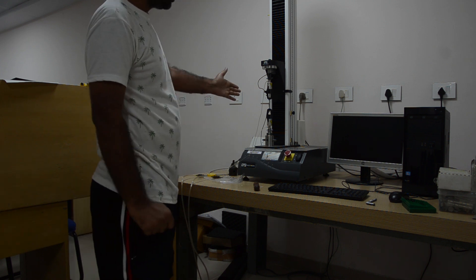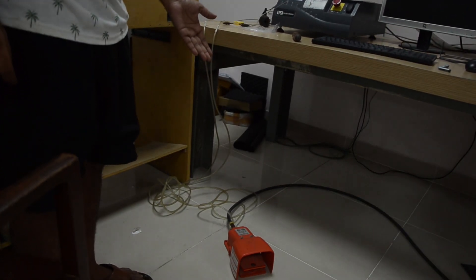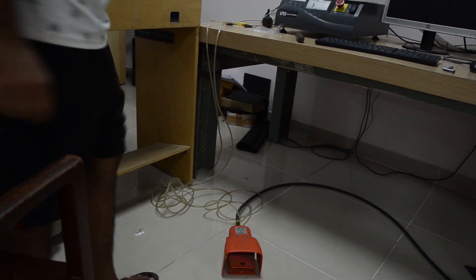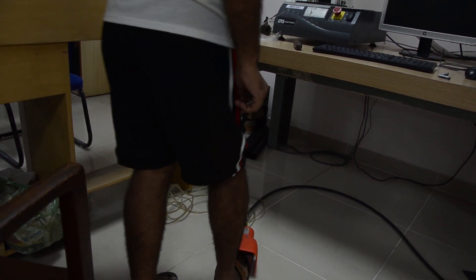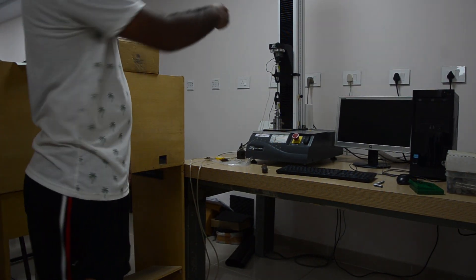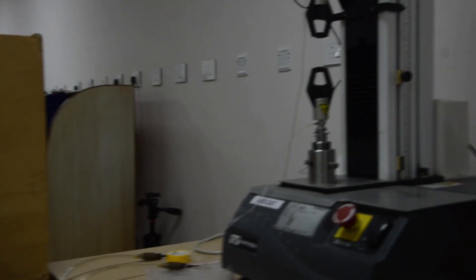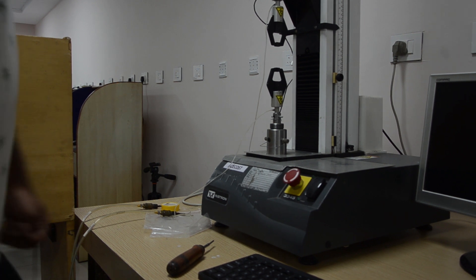We control the grips with the help of this foot valve. Just press it and it will work properly. There is a compressor. When pressed, you can see both grips are closed.